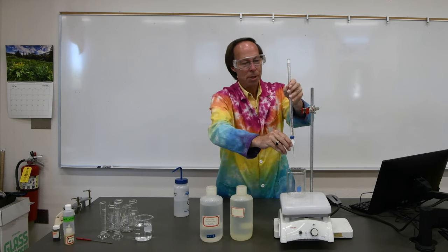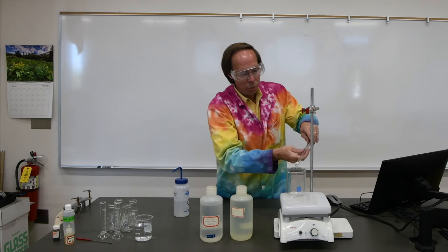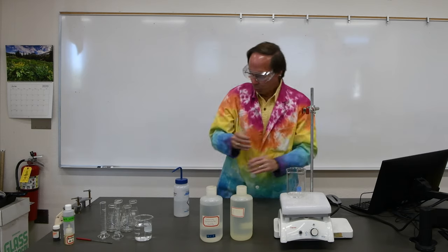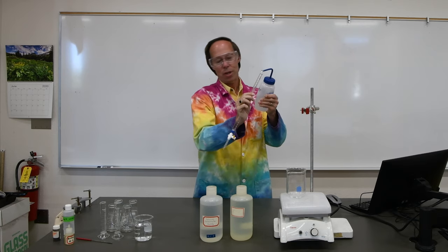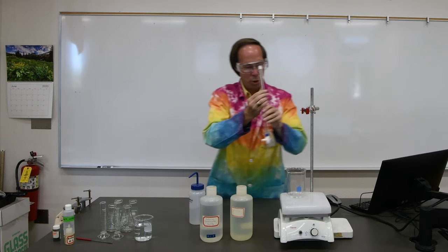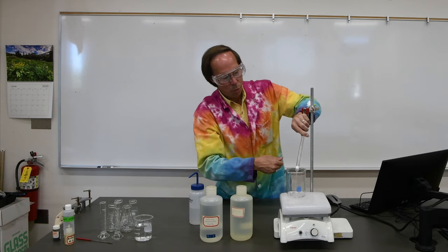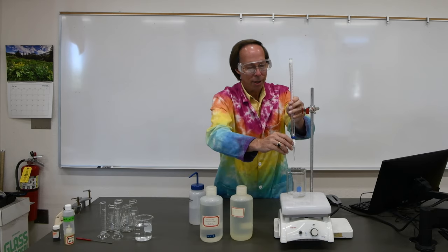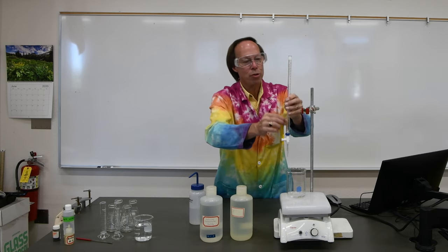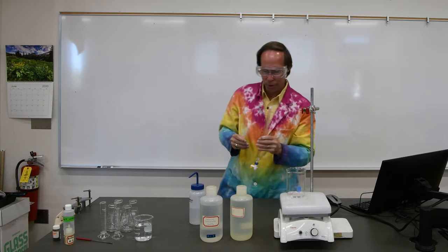That way, if there's any contamination in there from a previous experiment, we'll get rid of that. If you get tired of waiting for it to run out, of course, we can also pour it out the other way. We'll do two rinses just to be sure, and notice I'm rotating the burette around to rinse the sides down completely there, and we'll go ahead and drain that a little bit more. We'll pour out the rest of that water, and now there should be nothing in the burette except deionized water. There's still some deionized water on the sides. There's a little puddle of it down below there. We can't get it all out.